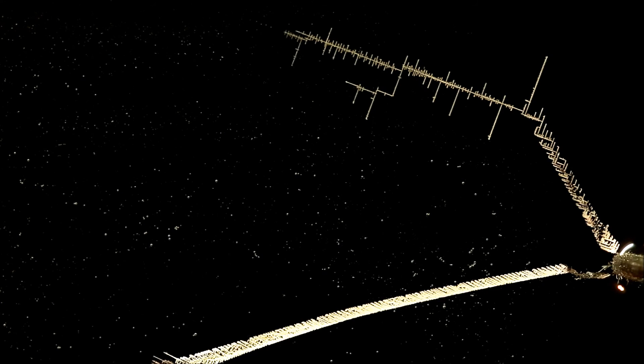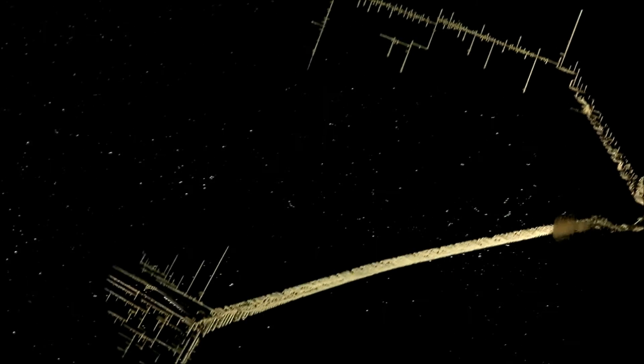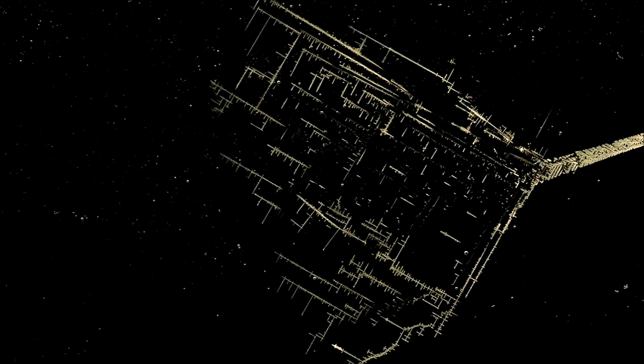What's happening is that the tin crystals grow in a flat structure. Sometimes these won't be perpendicular to the direction you're looking at, so they won't look very bright. They're not reflecting light into your eye. But then they get to a certain size or shape, and their weight causes their angle to shift, and they'll suddenly flash quite brilliantly. It's very dramatic.